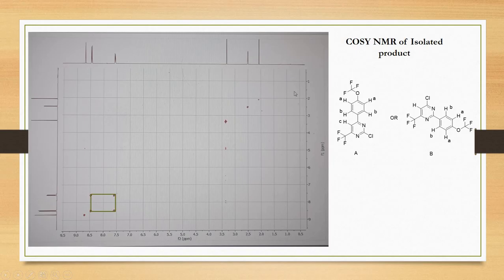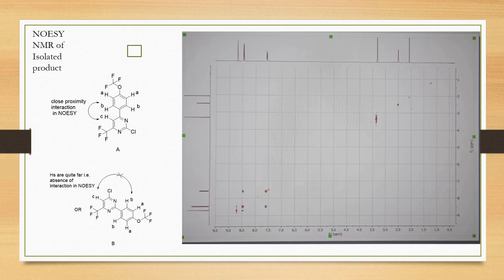Now let's move to the NOESY NMR. If you see, these protons are close to each other. So if your compound is A, then you must see the interaction between hydrogen C and hydrogen B. If your compound is B, then you will not see any interaction between this phenyl ring and this heterocyclic ring.